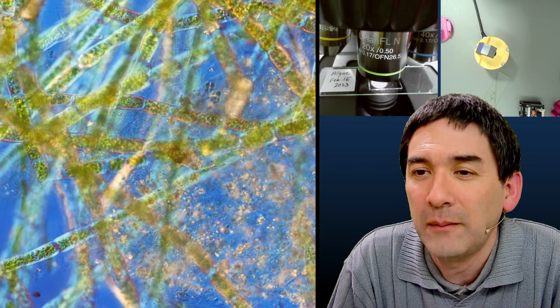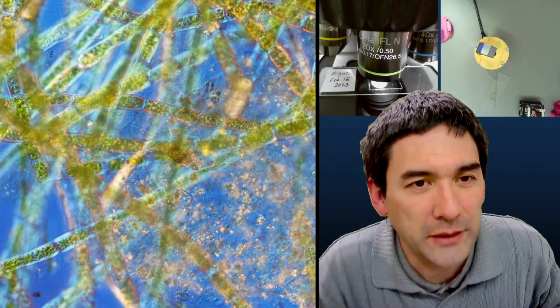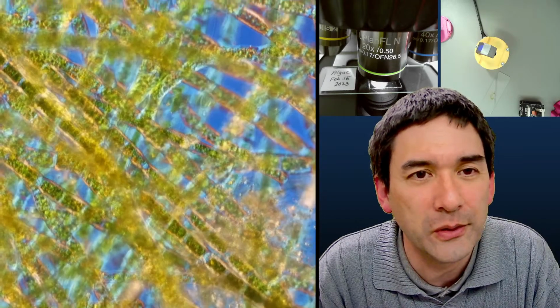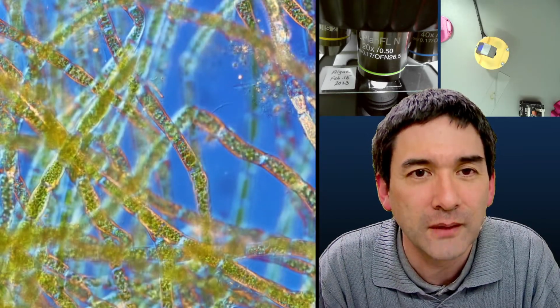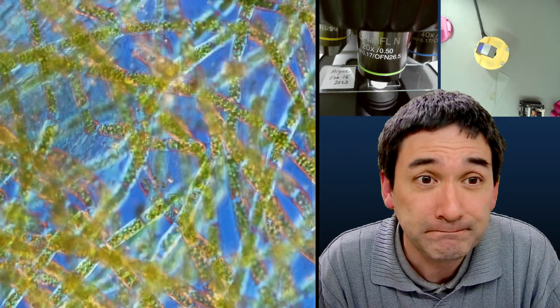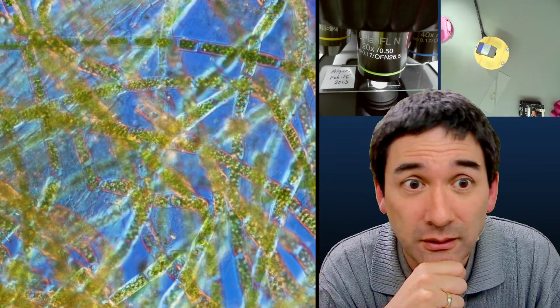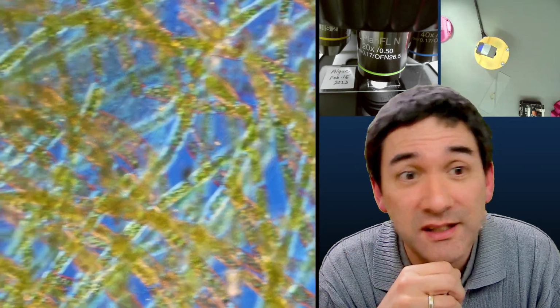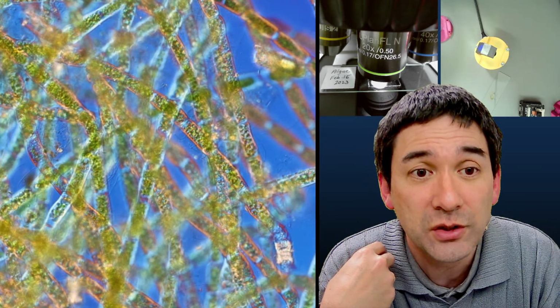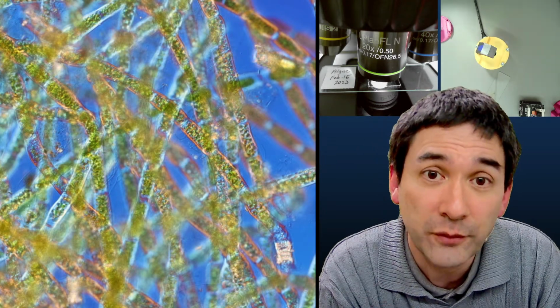Good idea. So what I would like to maybe talk a little bit about is identification. Let's just use this one that you see over here, because this is a very important concept. Some people want to say, okay, what is it? And I can tell you it's some kind of filamentous algae, and that's it. Okay, which species is it? Well, I don't know, because I'm not an expert in this. So you see, I can only stay very general on this. And if you want to know more, then you have to find an identification.